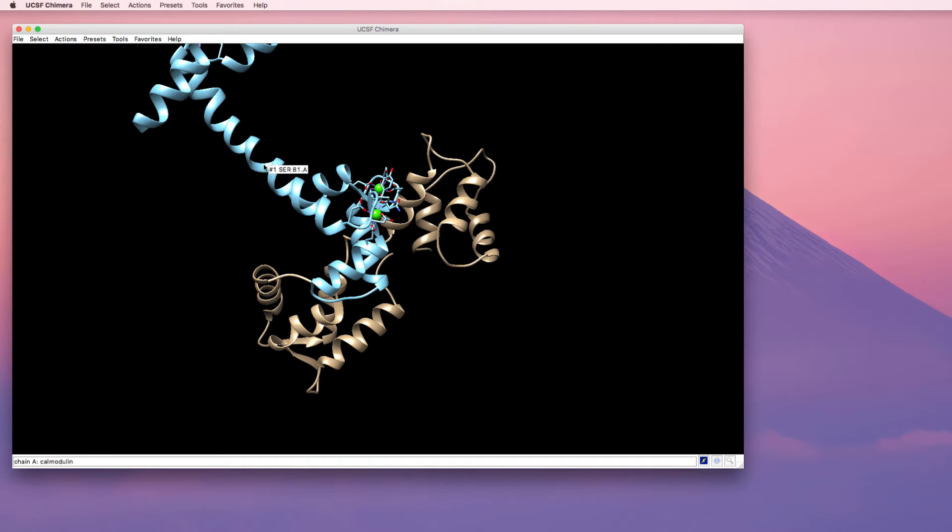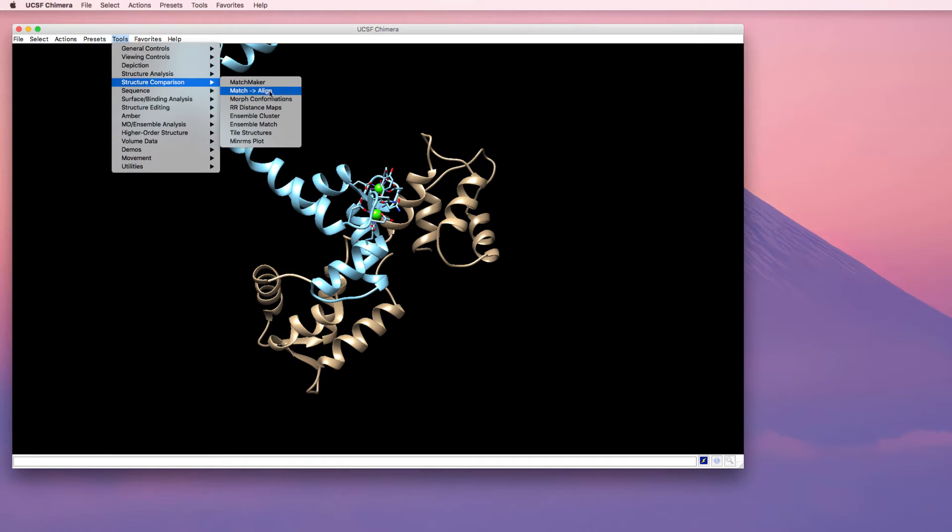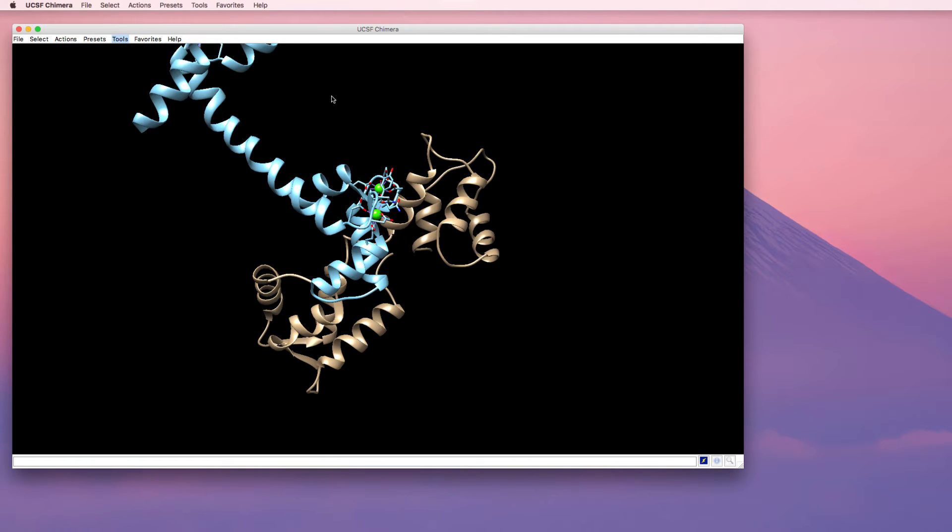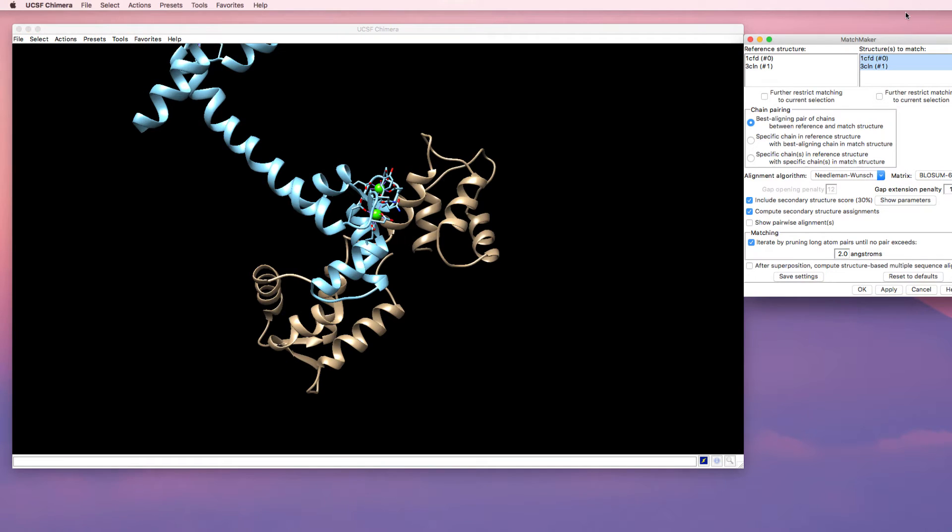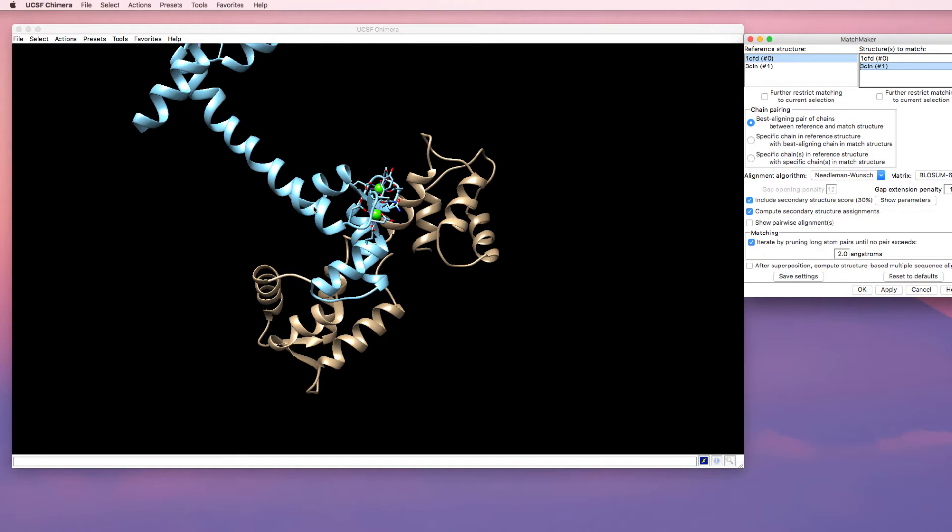Now I'm going to align these structures. I use the matchmaker tool to align the structures. I'm going to choose the APO form as the reference structure and the halo form as the structure to match. Now I would like to match a specific part of this structure. If I wanted to just match the structures automatically, I can press apply here.